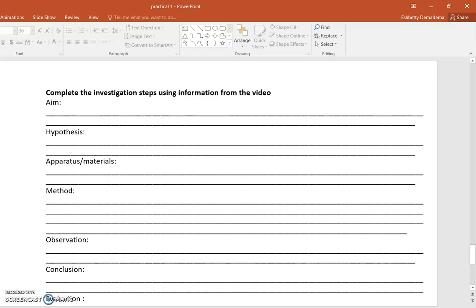So now I'm going to go to the experiment. Remember, I said the experiment is going to be in 2 parts, because we've got to wait for our coins to react. So they need a good 10 minutes to do that. So I will video record the first part and then stop and wait for 10 minutes, then come back and do the rest of the video.